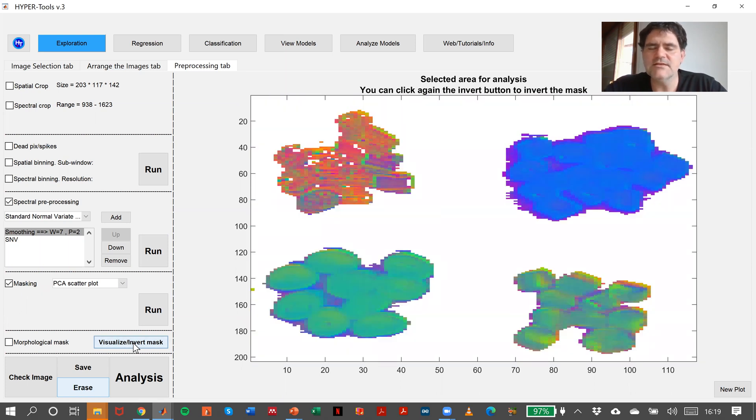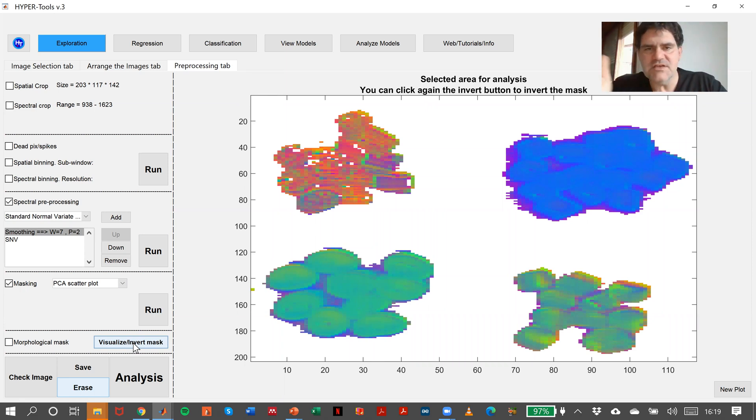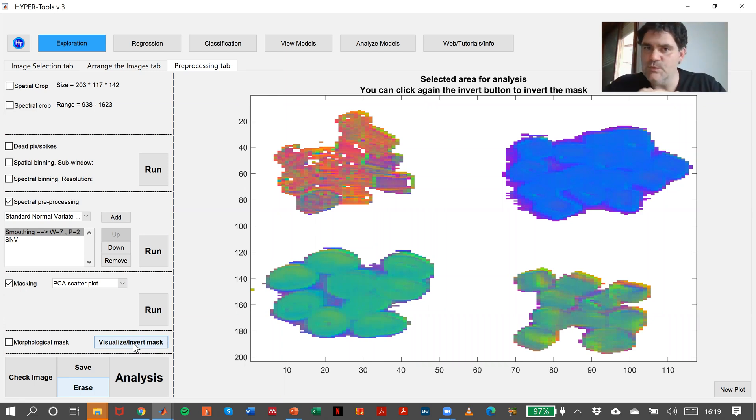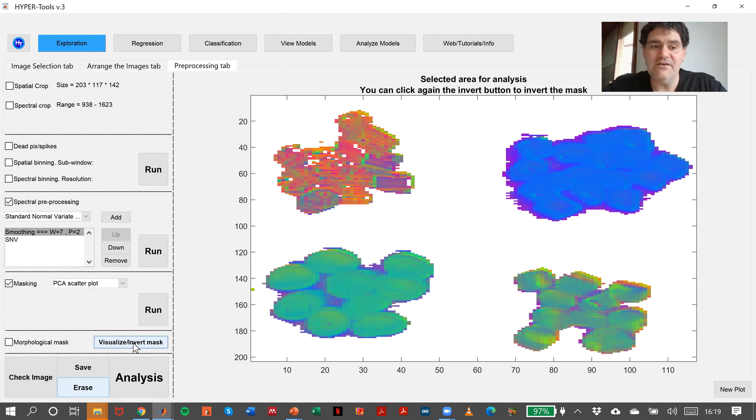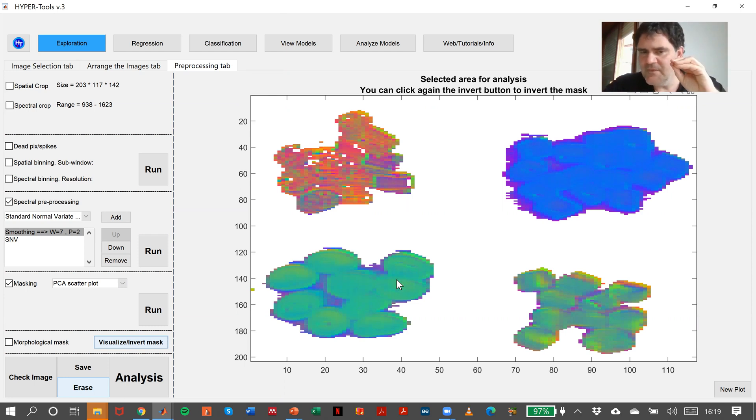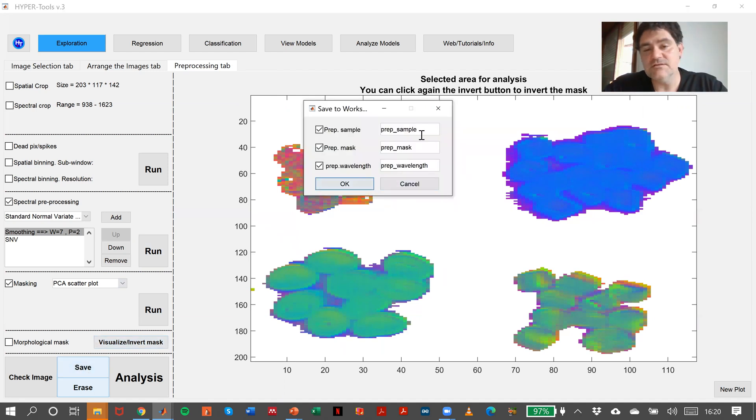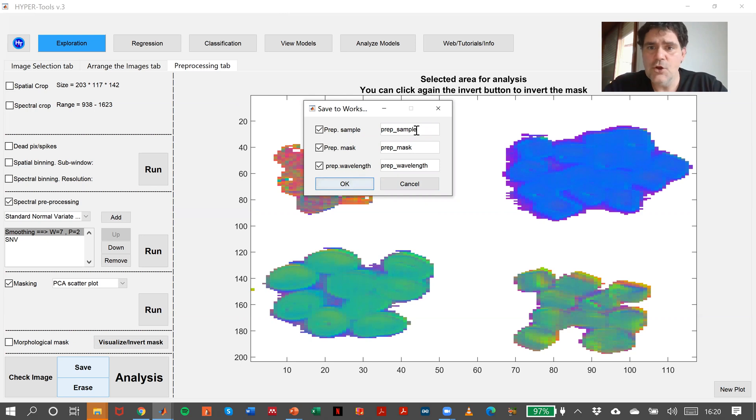In this case, this does not mean that you have to analyze your image afterwards with SNV and smoothing. What it means is that we have created a mask that directly displays the plastics and removes the background. So in this case, what we can do is to save this.